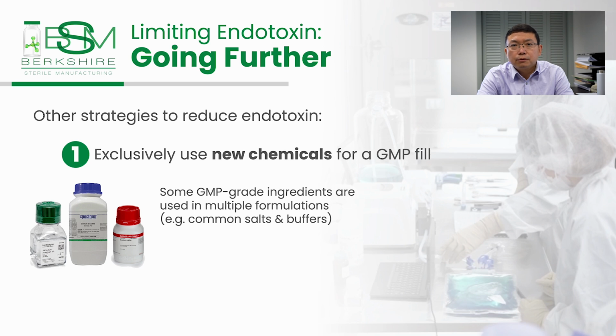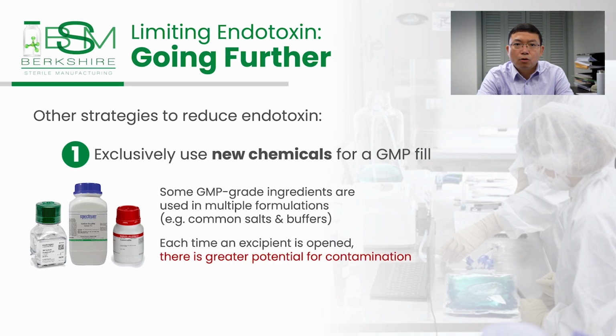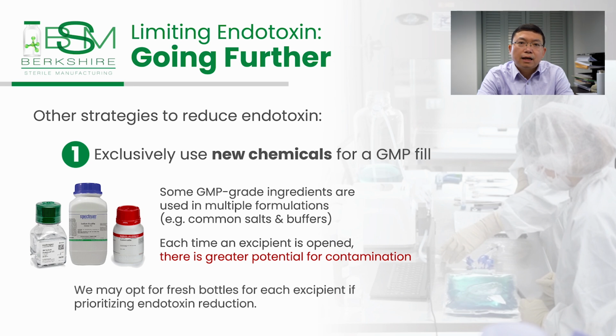Even though those materials are only opened in a grade C clean room for a brief period, each time an excipient is opened, there is a potential for contamination to enter the bottle. To prioritize endotoxin reduction, we may opt to use fresh bottles for each excipient, guaranteeing that the bottle we are drawing from has remained sealed until the fill, minimizing the risk of contamination.